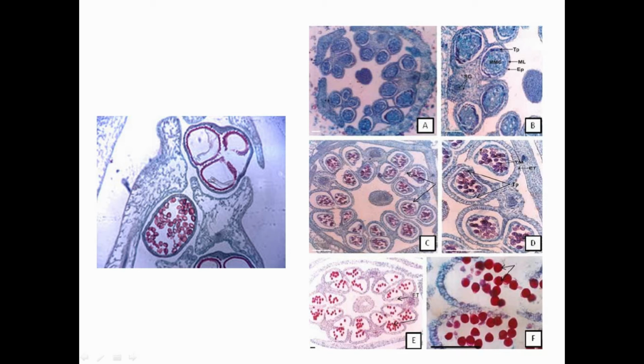Here you should know one more point, that microspore starts germinating in situ, that is while enclosed inside the microsporangium or pollen sac, and this is called precocious germination. Microspore may be best defined as partially developed male gametophyte.